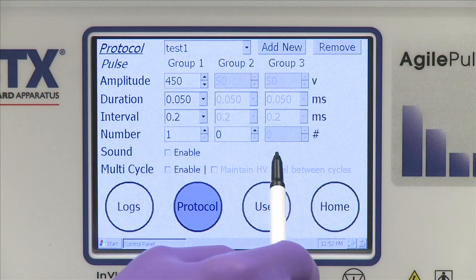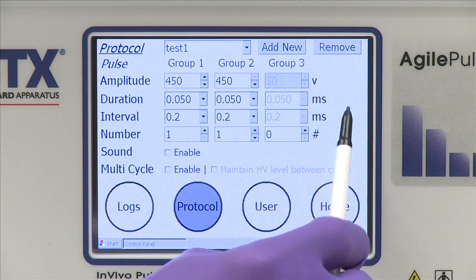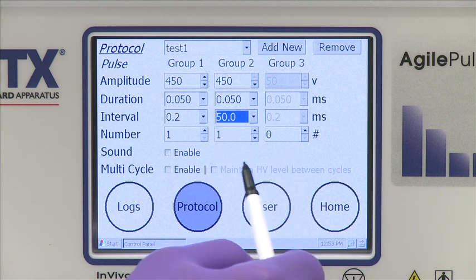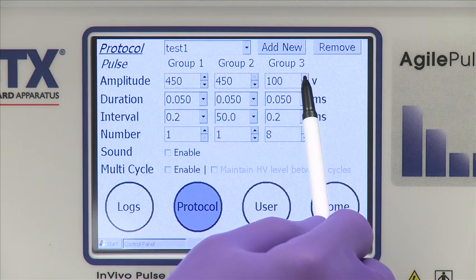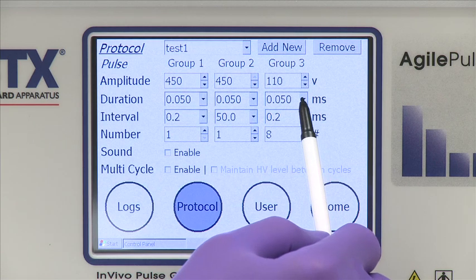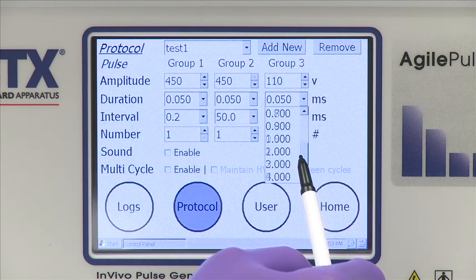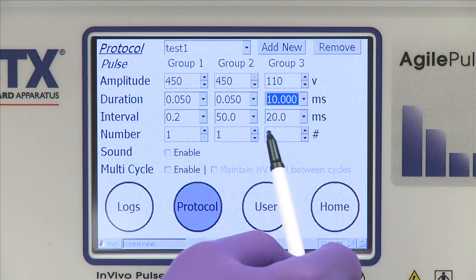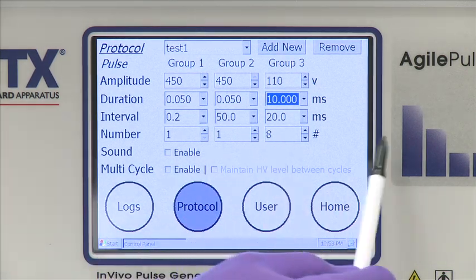Next, program group two for one pulse, 450 volts, a 50 microsecond duration. Set the pulse interval to 50 milliseconds. The final set for group three consists of eight pulses, 110 volts, and a pulse duration of 10 milliseconds. The default interval for these parameters is 20 milliseconds.